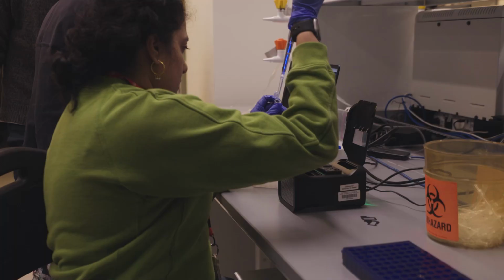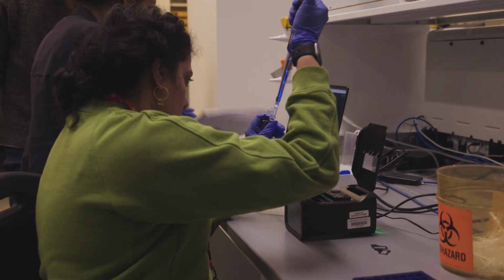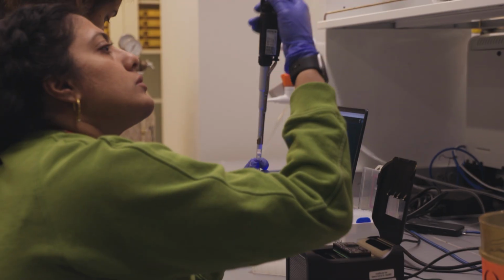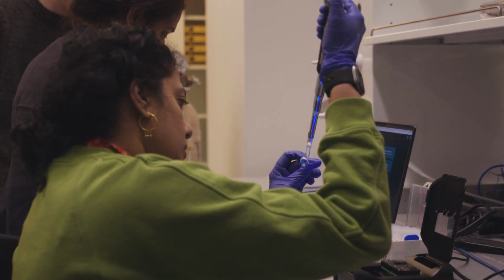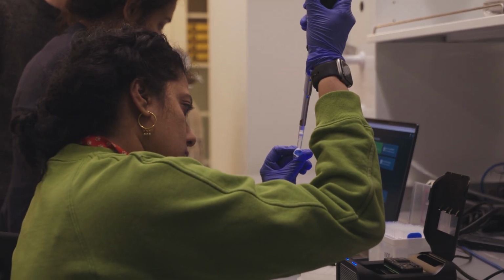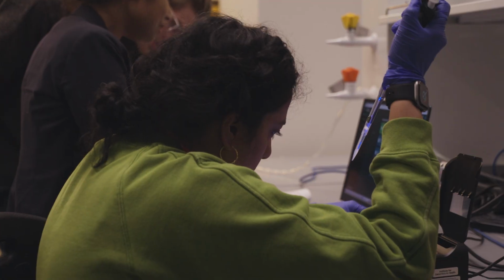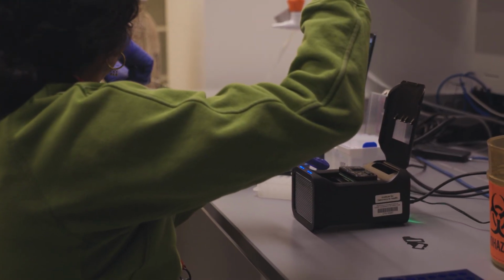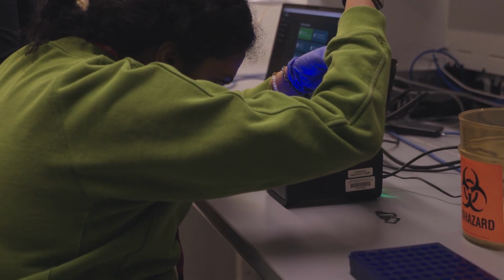Okay. And we're here, 12. That's 12. And then we have to put the light shield. It's a little finicky, right? You saw it in the morning. The other side, we closed it already.